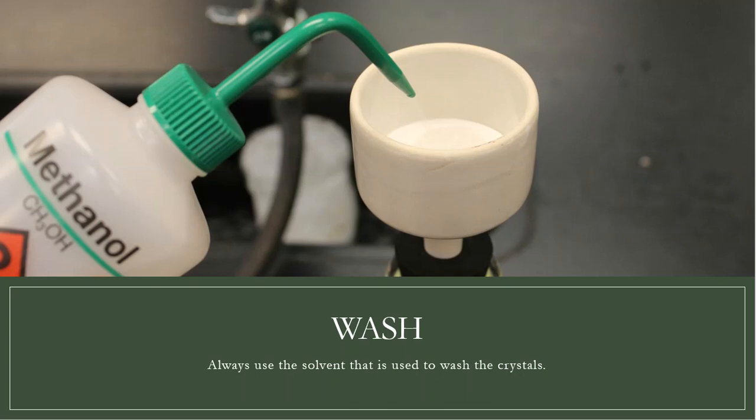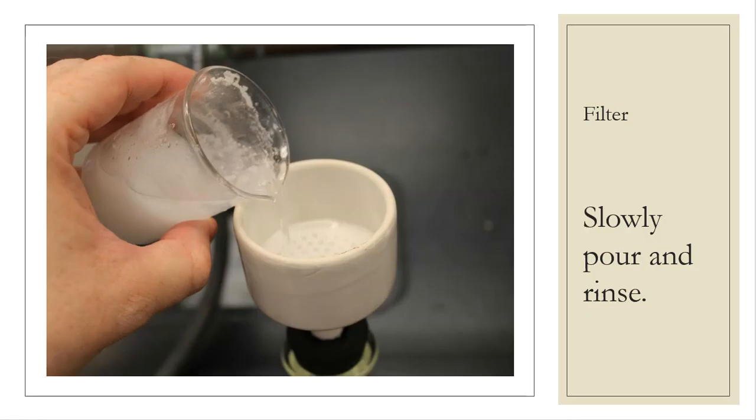All right, so the way that we seat the filter paper is I use some ice cold methanol to rinse the filter paper in the very beginning when the aspirator or the suction is on. When I do that, it makes the filter paper wet. That wet filter paper will stick to the bottom of the funnel much better, and it will help ensure that all of those holes are completely sealed up. And then I'm ready to pour my alkane clathrate through.